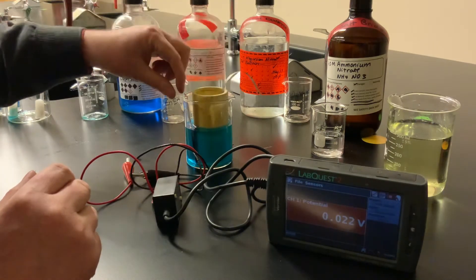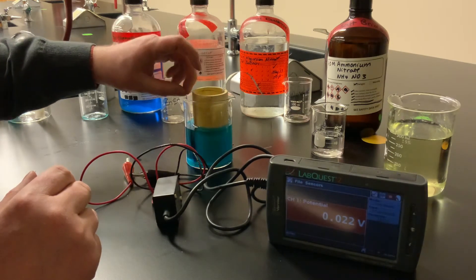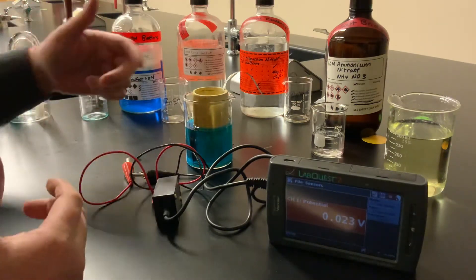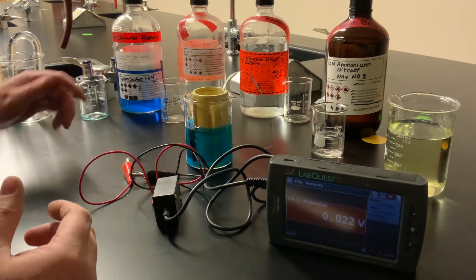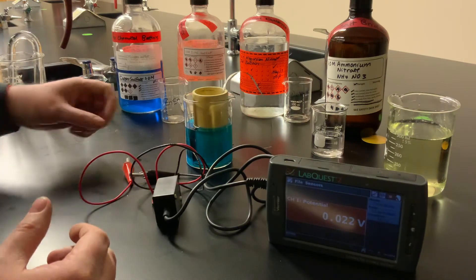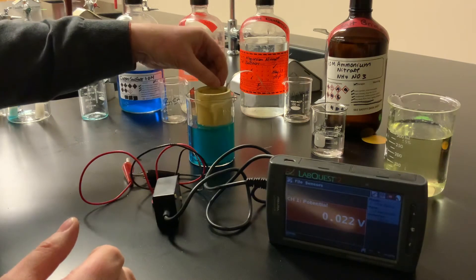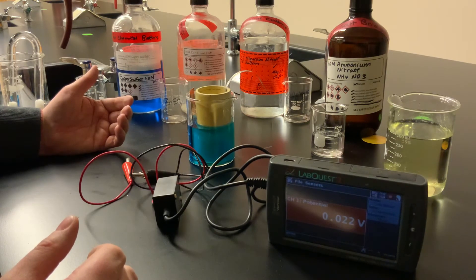I'll pour the copper sulfate solution outside the clay cup into the beaker. So one half cell is inside the clay cup — it contains the magnesium nitrate solution and the magnesium metal strip. The other half cell is outside the clay cup — it's the one molar copper sulfate and the copper electrode. Because the clay cup is porous, it allows liquid and anything dissolved in it to move through its walls, so we no longer need a U-tube as a salt bridge. The ions in the solutions can move through the walls of the clay cup to complete the circuit.